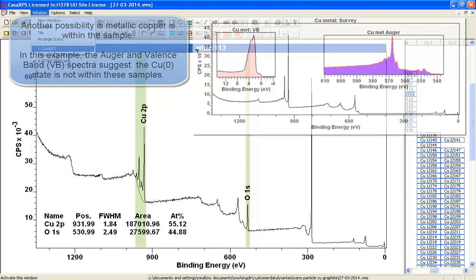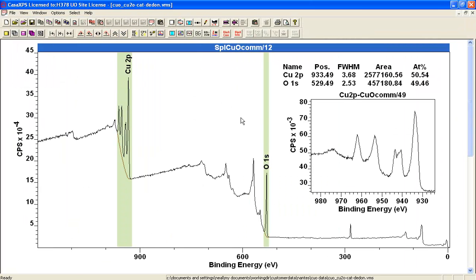Another way to look at this is to go to a standard material, something that is known to be copper 2+, and see what kind of results we get from performing the same analysis for the oxygen and the copper 2p. And here is an example where you can see that, in fact, this is very close indeed. This is 1 to 1. So this is the copper 2+, at least this is what these results would suggest.